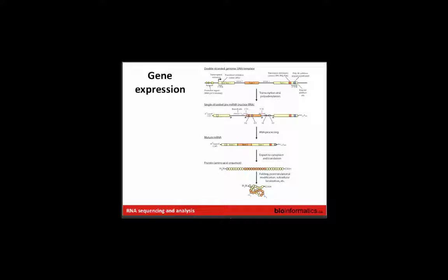This thing is really the subject of a lot of RNA-seq analysis, either mature mRNAs or small RNAs that won't be polyadenylated, or ribosomal RNAs, which may also not be polyadenylated.